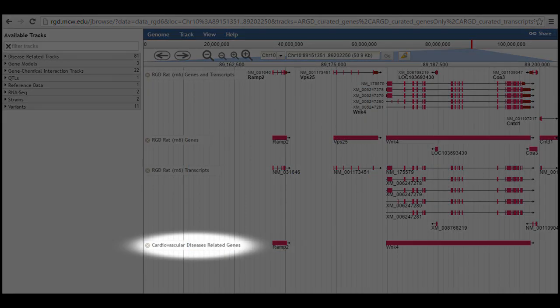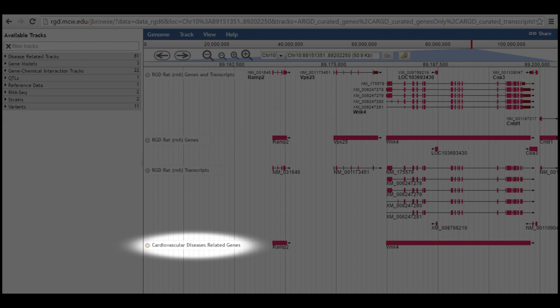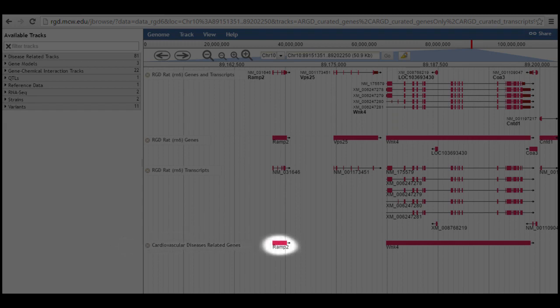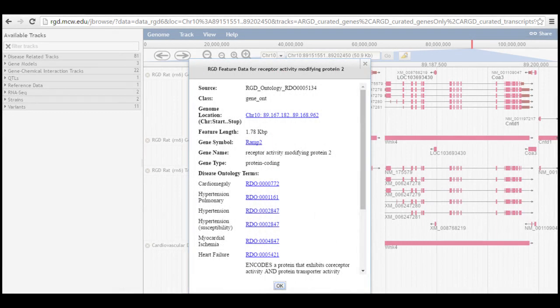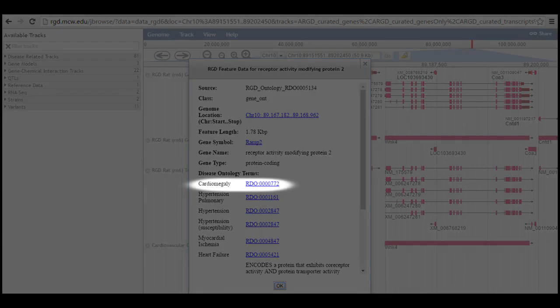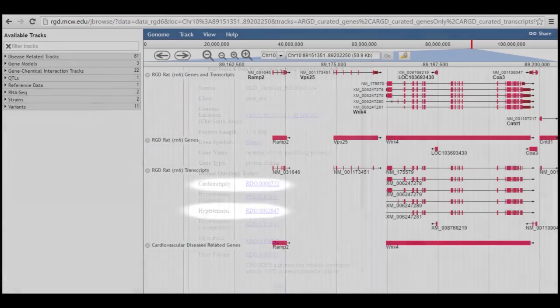The disease-related tracks and the gene-chemical interaction tracks categories are both populated based on the RGD's ontology annotations, meaning that only objects with annotations to a particular category of terms will appear in the tracks for that category. Pop-ups for these objects list the annotations related to the selected category, in this case cardiomegaly, hypertension, etc.